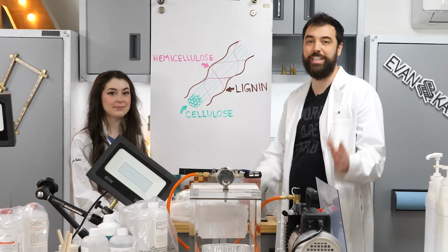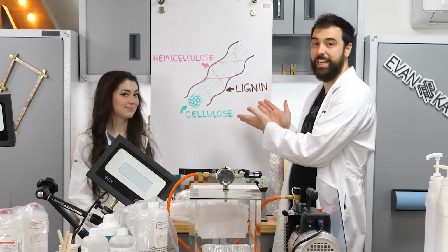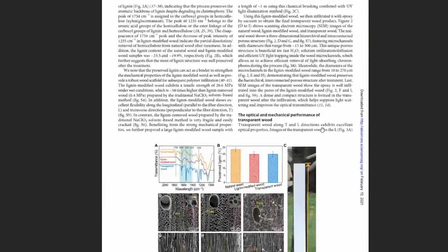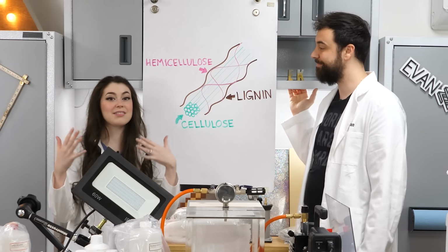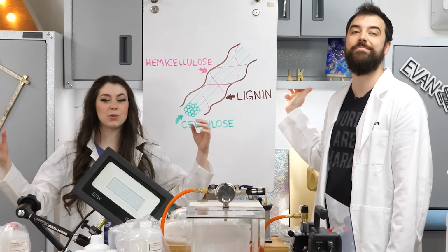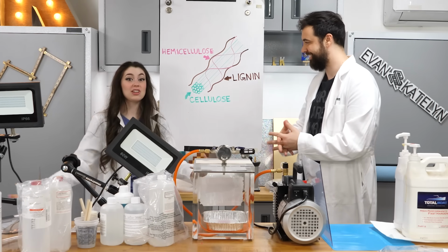Some of you guys reached out to us on Twitter when a new paper came out where they didn't remove the lignin, they just chemically bleached it, which removed the chromophores, which are the particles responsible for granting color, which should leave the wood colorless. Now, colorless doesn't mean clear necessarily. It should actually end up looking kind of white, but that's where the resin comes in. So we will infuse resin into the wood with the power of vacuums, and then it should look clear.